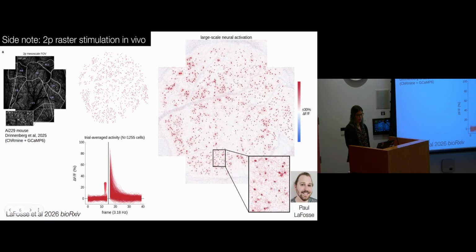We mask out the stimulation time because there's crosstalk, or like you can see the laser basically on the PMT, and then you have the response after the stimulation. And here we're just stimulating a single frame. You can stimulate more frames. So we're stimulating the single frame across 300 milliseconds, which is our recording time, 3 hertz.